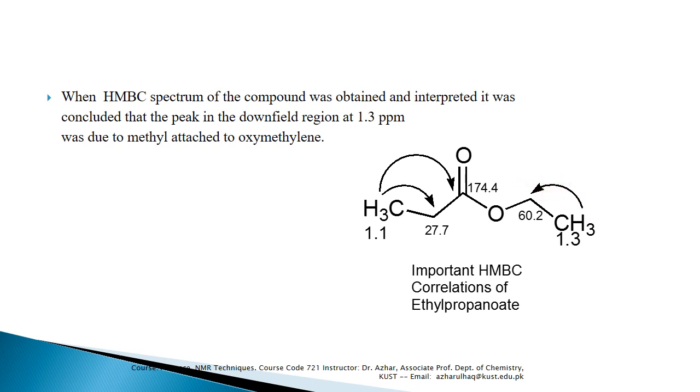oxymethylenic carbon. So this technique has solved the problem, and this technique is usually used for such type of problem to show connectivity of the otherwise separated fragments in the molecule.